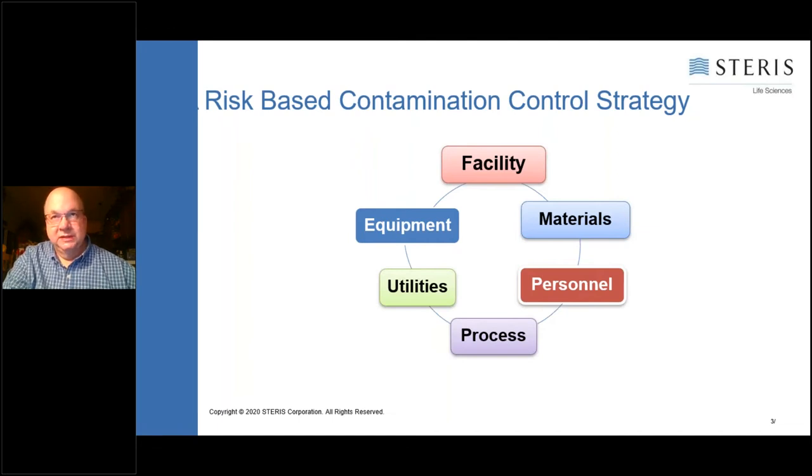Another big source is the materials and anything that you're bringing into the clean room. In fact, raw materials oftentimes are looked at as potential sources of contamination. Of course, operators, personnel in clean rooms, that accounts for about 80% of the bioburden in the room. And that's because we shed millions of particles and millions of skin flakes a day. And on those surfaces in the clean room can land potentially viable microorganisms from the operator or person in the clean room. And of course, whatever your process is in that clean room facility.